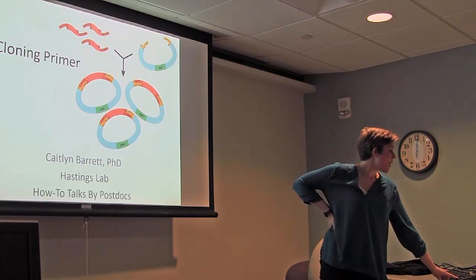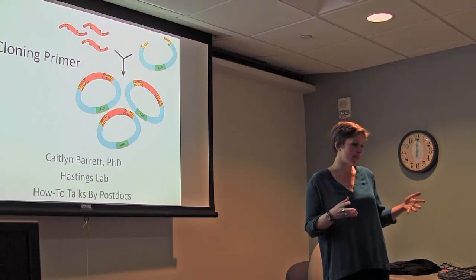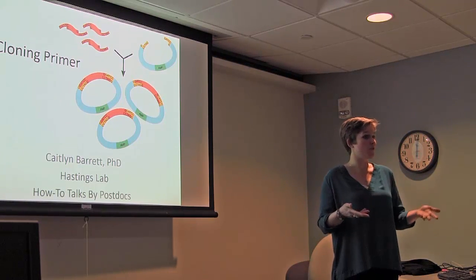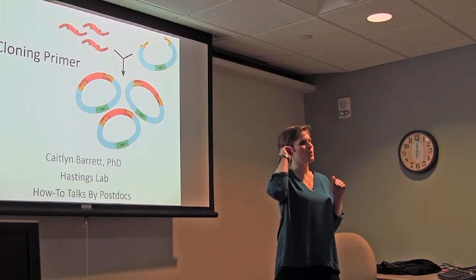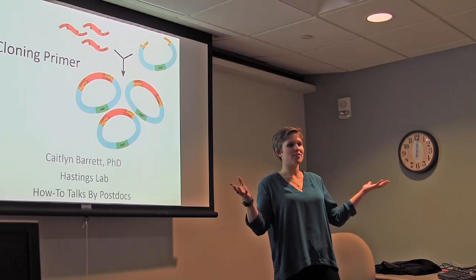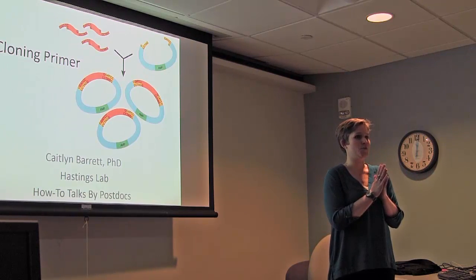Okay, so what I'm going to do today is give you a very basic outline on how molecular cloning works. Then we're going to go through an example using some technology that the Health Sciences Library actually has available for you guys. I'll show you exactly how I would go through the planning process of cloning, going from having an insert that I want and a destination vector that I want and combining the two. And then, once you know the theory, I'm going to show you some tricks.